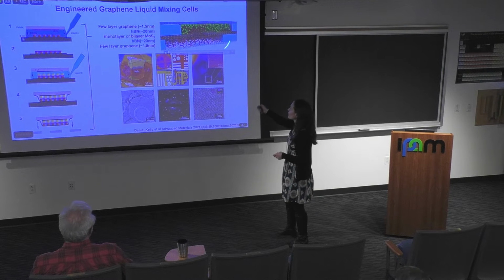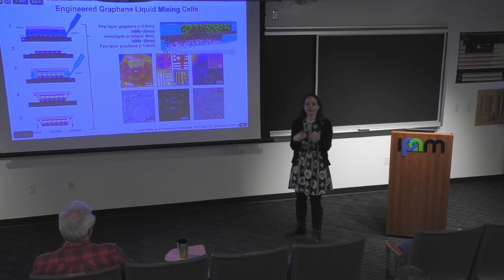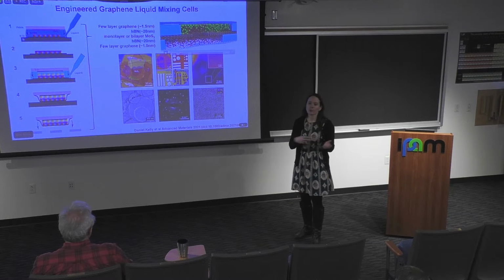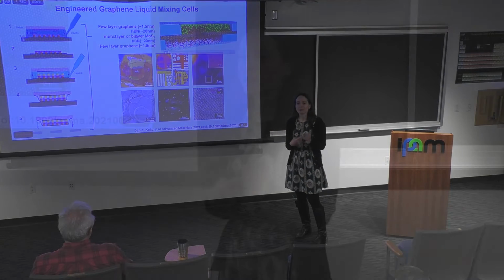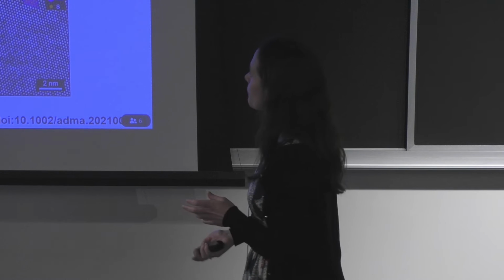Okay, so this is the broad geometry. The liquid cells that we have don't just have one nano aquarium. We're doing electron beam lithography, so we would typically pattern 100 by 100 individual wells within these crystals. So we can repeat the experiments at different electron beam dose rates, and we're working on opportunities for being able to repeat those experiments with different conditions.